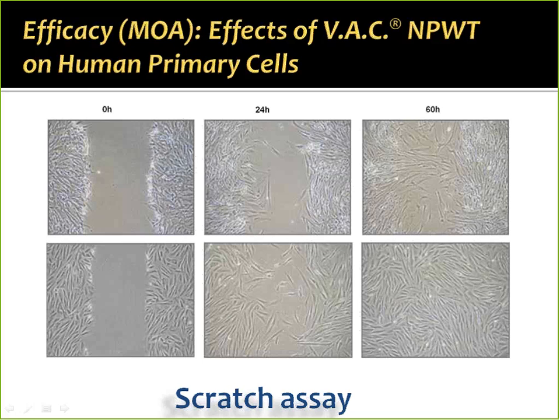The issue with this method is that we need to monitor the cultures for migration at 2 hours, at 4 hours, at 8 hours, 12 hours, 24 hours, 48, even sometimes longer than that. Because different cells migrate at different rates, it really doesn't help to compare two treatments if these in-between stages have been already missed. Sometimes this goes from here to here in a matter of hours, and it's really difficult to tell exactly what the kinetics is going to be. So it is really important to monitor these monolayers quite extensively. You can imagine that you spend a lot of time in the microscope, and the hours are really rigorous, and it's very time consuming.